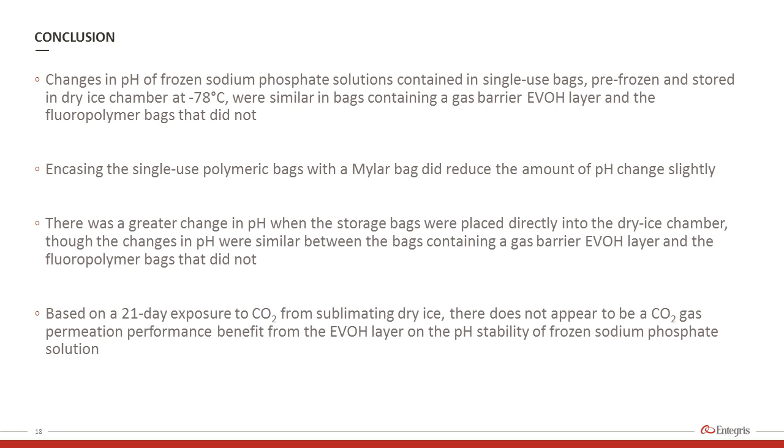There was a greater change in pH when the storage bags were placed directly into the dry ice chamber, though the changes in pH were similar between the bags containing an EVOH layer and the single-layer fluoropolymer bags. So, based on a 21-day exposure to CO2 from sublimating dry ice, there does not appear to be a CO2 gas permeation performance benefit from the EVOH layer on the stability of frozen sodium phosphate solutions.